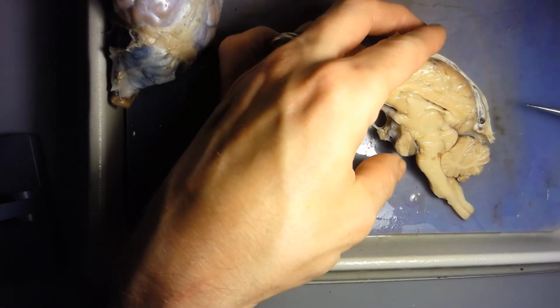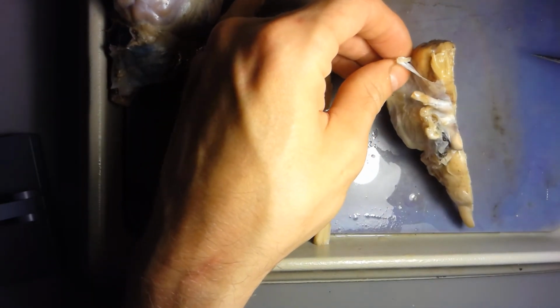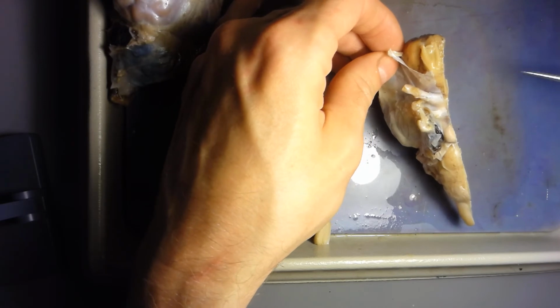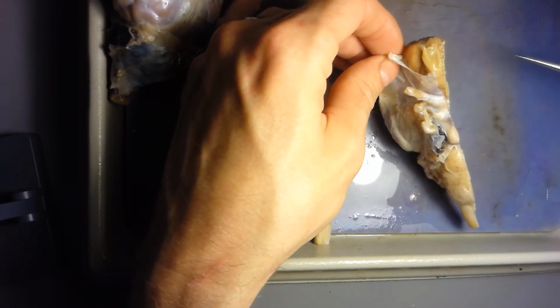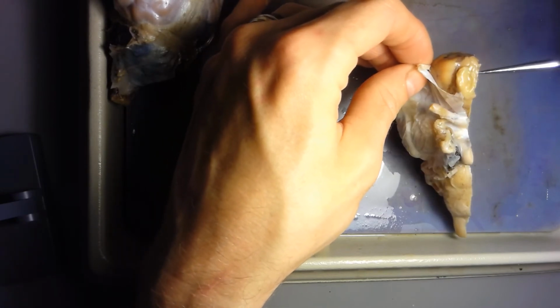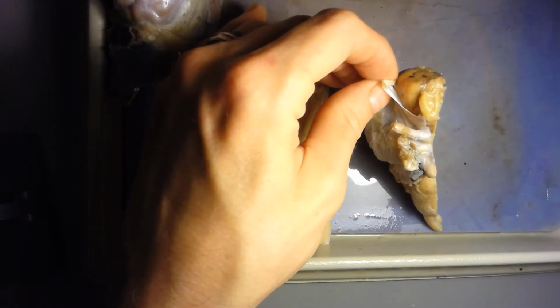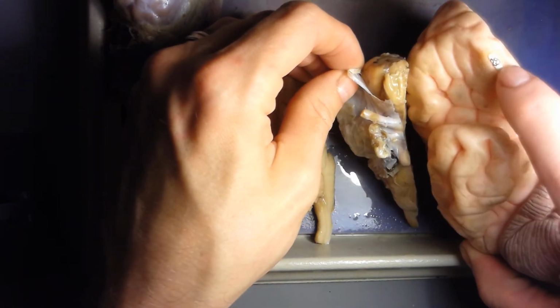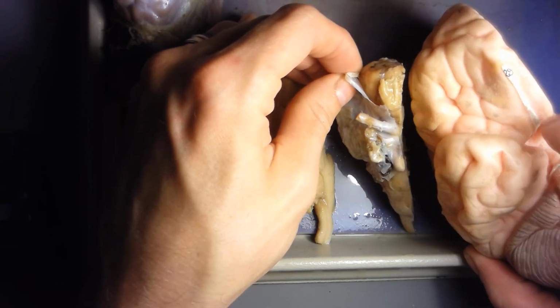Okay, now looking at the cranial nerves. The cranial nerves are really difficult to see on the brain outside of the first two. So on the actual brain, I'm only going to test you on the first two, the olfactory and the optic. This olfactory bulb is very large in the sheep brain. If you remember what it looked like on the brain model, that is a representation of the human olfactory bulb, and it's tiny.